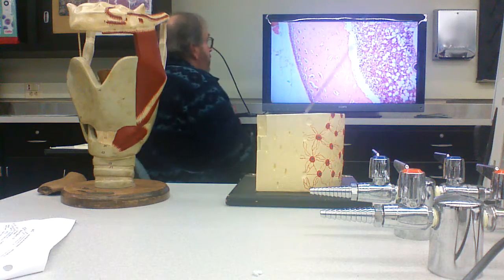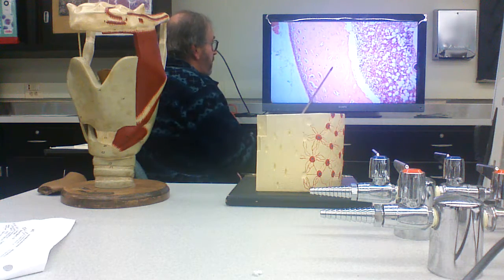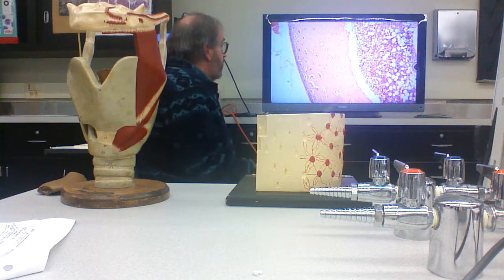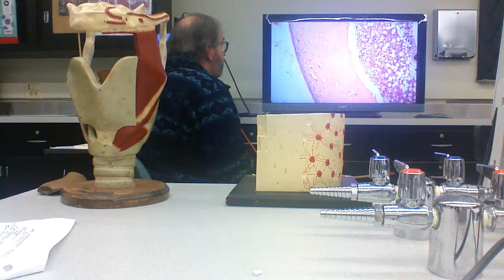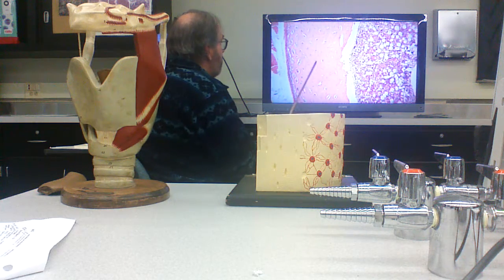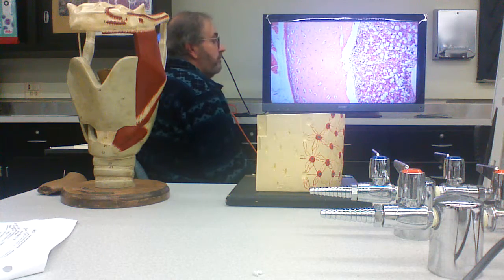You can see either Haversian canals, which are going to appear circular, or the Volkmann's canals, which in cross-section will appear more or less longitudinal. And all of this other stuff may or may not give you an example of concentric layers. This one does a pretty good job of that. These would have been parts of osteons.